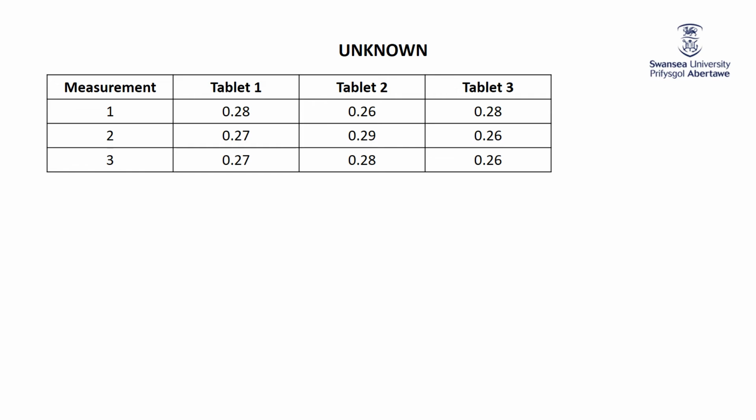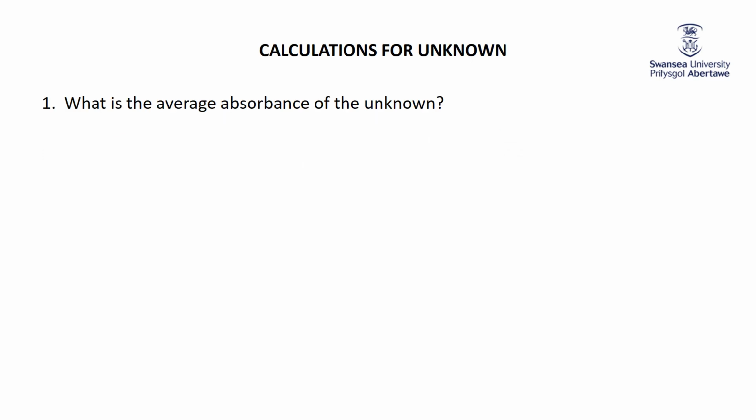If you remember what I did, I crunched up an aspirin tablet, dissolved it ultimately in 250 cubic centimeters of solution, and then took 3 samples of that, which I treated in exactly the same way I did with the sodium salicylate solution. In other words, dissolved it up, reacted it with Trinder's reagent to make that nice, pretty purple iron complex, and I did that with 3 tablets. So I have 9 bits of data, and the average absorbance is 0.272. So now going to the questions.